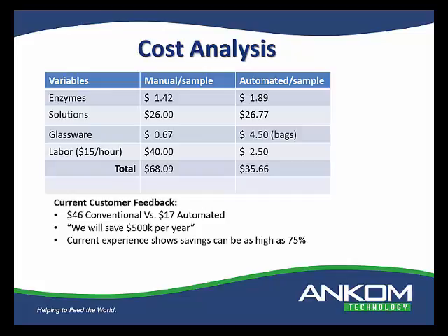Probably could have got more use than that, but for the sake of the time that I was there, we used the bag 4 times. So that reduces that cost by a considerable amount. I think that would make the bag about 17 cents, less than a quarter. But again, we're just using prices as it is, figuring 1 use each.